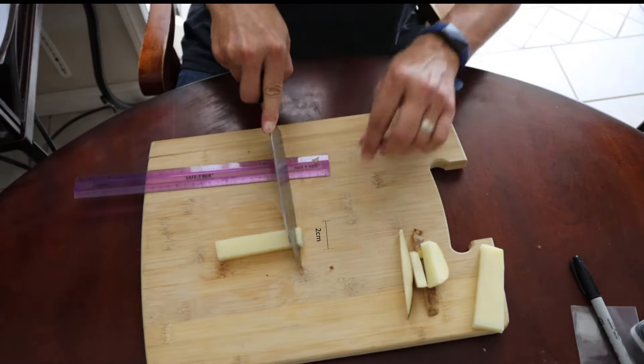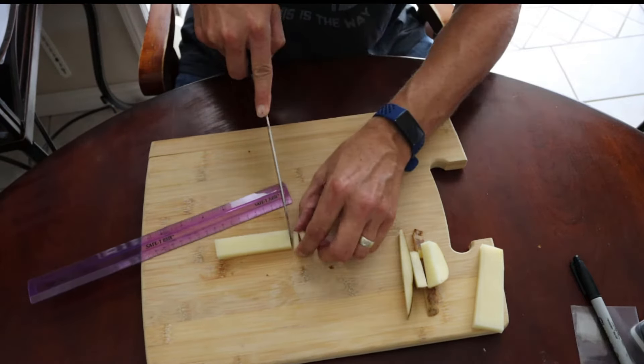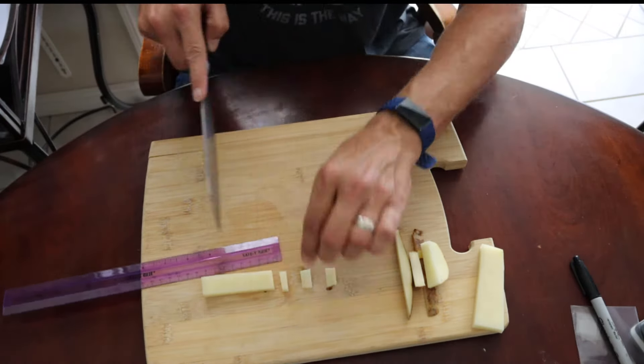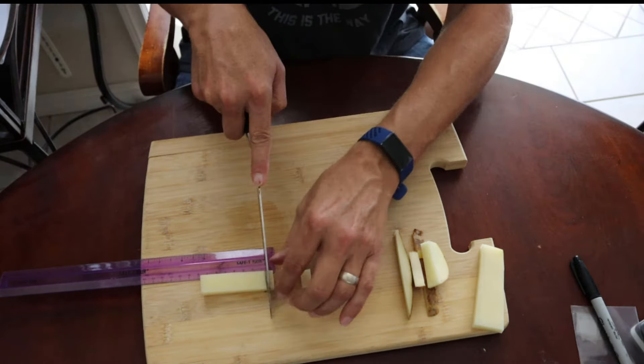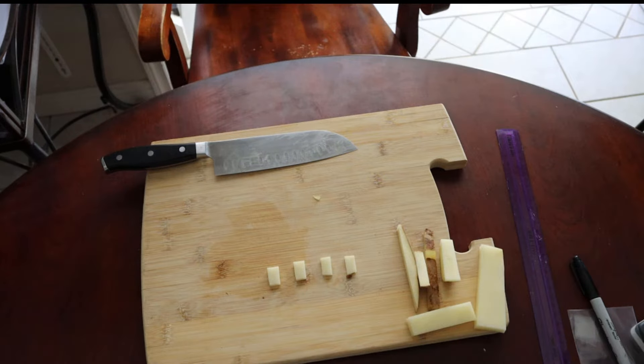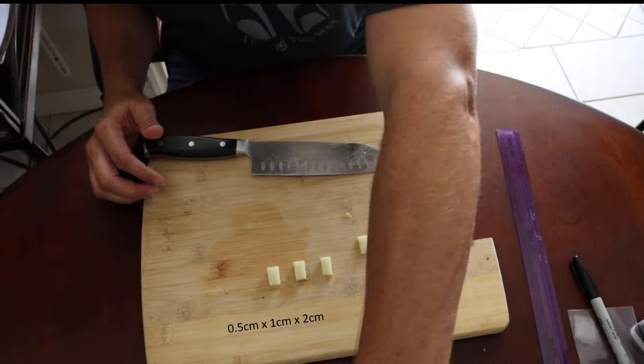Then we cut a two-centimeter section and then we cut four half-centimeter sections like you see there. And again this is high speed, so I'm really not cutting this quick. The result at that point is we have our four pieces of potato—one, two, three, and four—and they are one centimeter by two centimeters by half a centimeter.